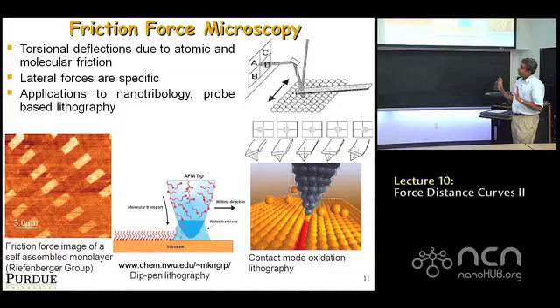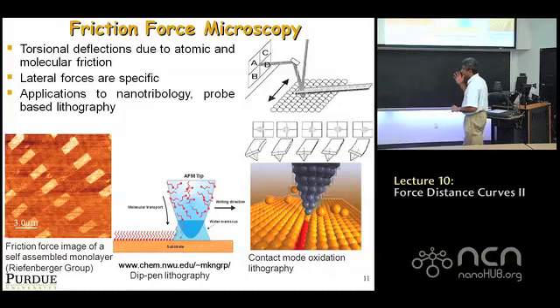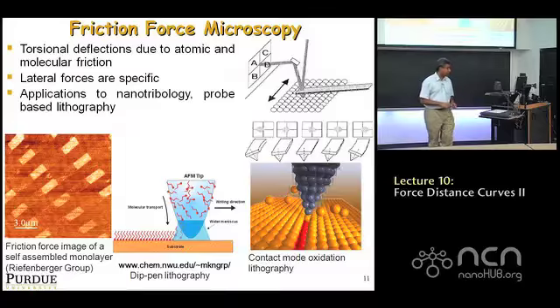So, a quick, rapid overview: we're doing force distance curves to study fundamental forces, but ultimately you're going to use it for contact mode. When you do contact mode, you can do friction force, you can do lithography, a lot of interesting things. So the implications of understanding force-distance curves filter into all these different things. What set point forces would you choose for these kinds of applications?